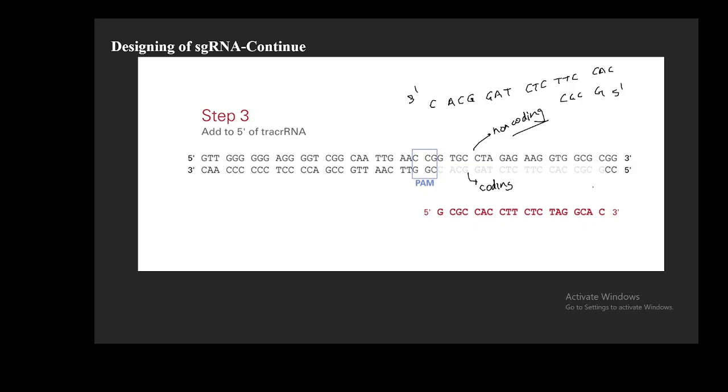So that is how you need to design the sgRNA sequences. So this is again the sgRNA sequence, which has the complementary sequence to this non-coding strand. Okay, so that's how the softwares also design the sgRNA.